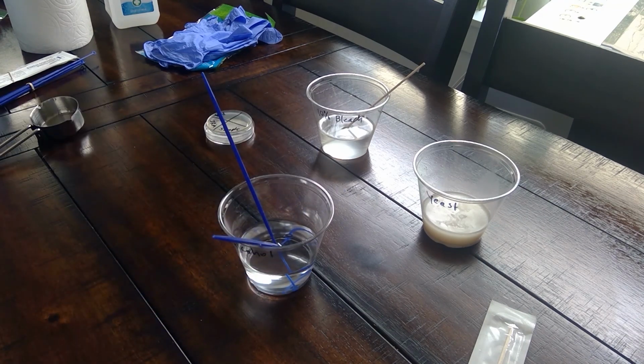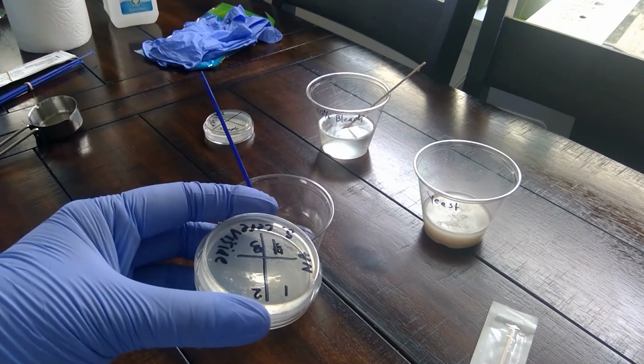Alright, so I'm not sure if you'll be able to see my streak patterns really.